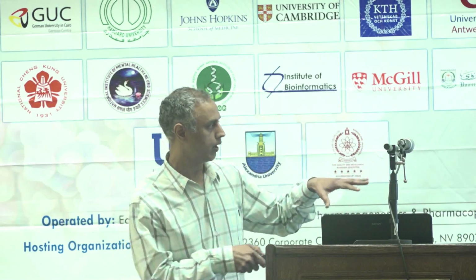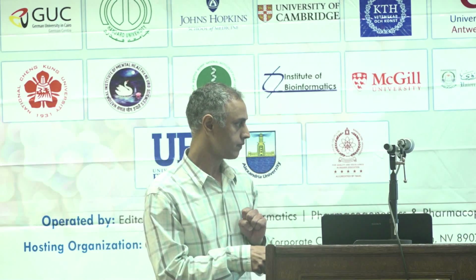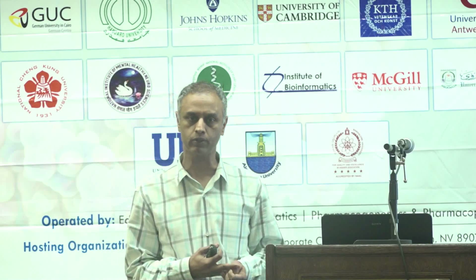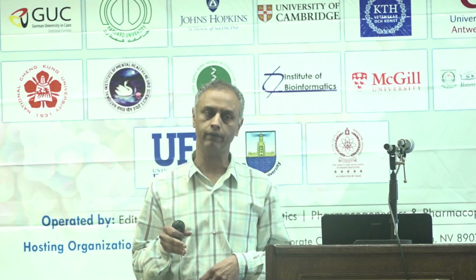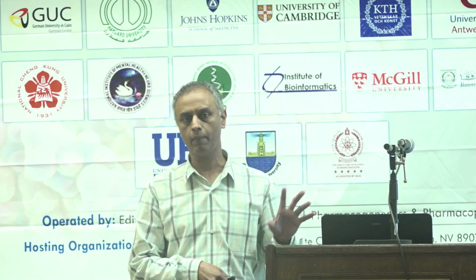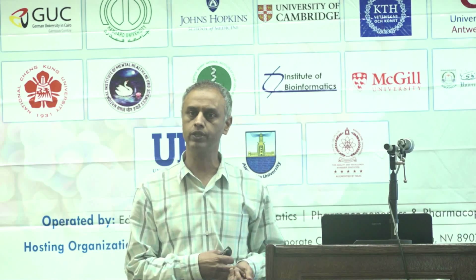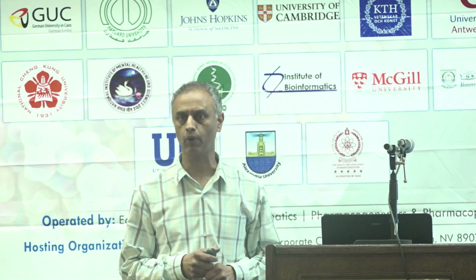And I will tell you that now that it is used, what are still the problems with this? It relies on measurements of intact protein masses. Most of the talk that we have had, when people say proteomics today, they almost imagine that it is sequencing of peptides. It is bottom-up proteomics. Here, we are not talking about peptide sequencing, we are talking about protein masses. And we all know how heterogeneous proteins are, and proteins carry many different post-translational modifications.